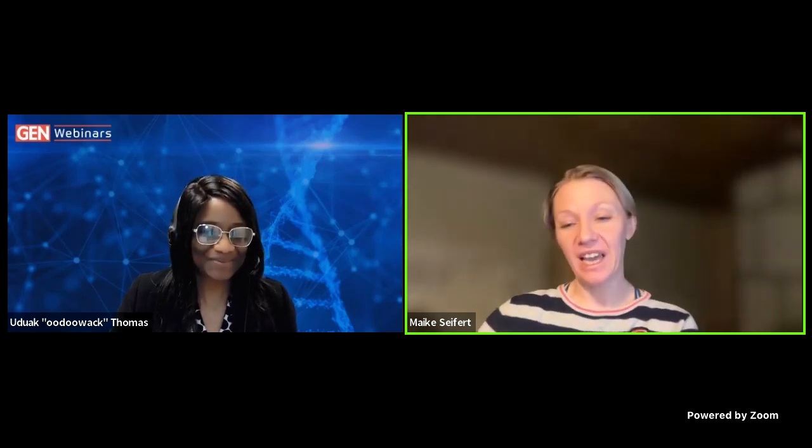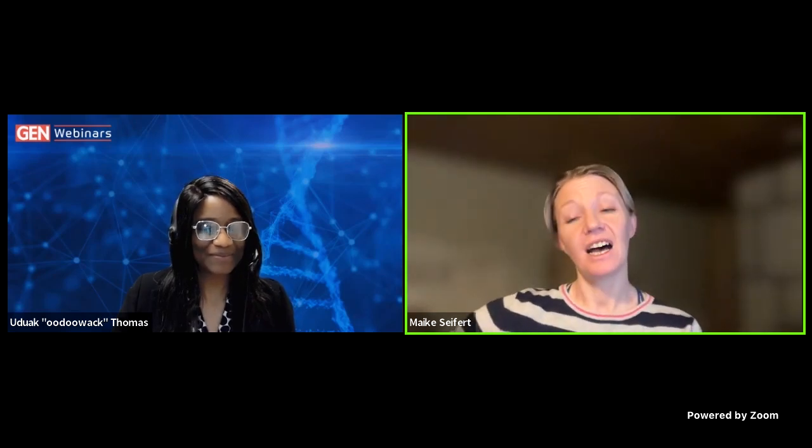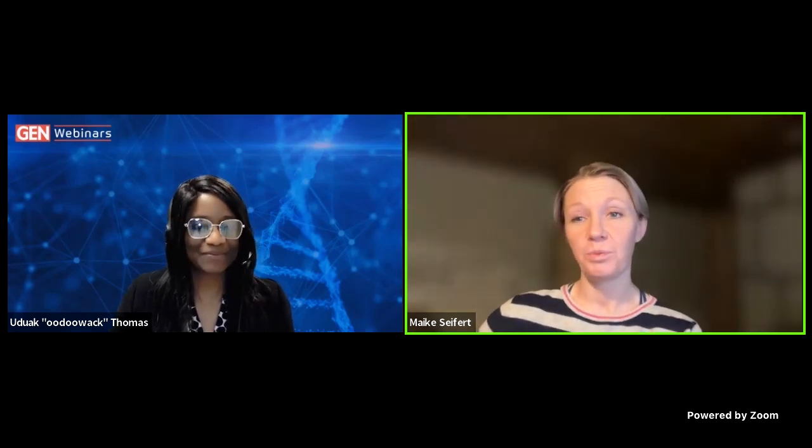Yes. Again, this is a very broad question. We do validation of everything. We have validated every single part of the pipeline. We have validated all the sample taking procedures and all the sample material. We have validated the extraction procedures, the library preparation procedures, and the sequencing procedures in all the individual labs with different standards that we use externally and internally. That means we use them as separate validation samples, but we also use them within each individual sample to make sure that the sample itself is processing as it should under the conditions that we are actually treating it.